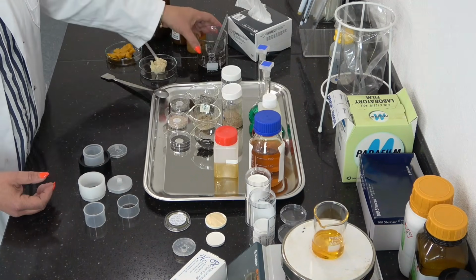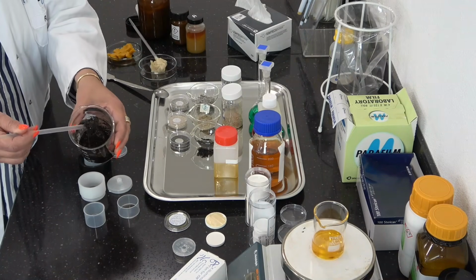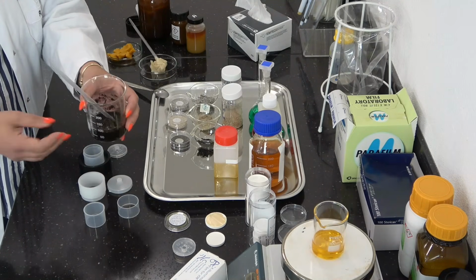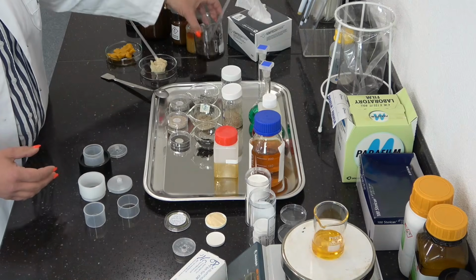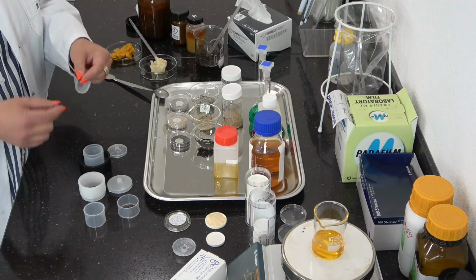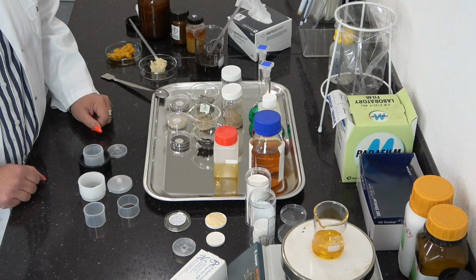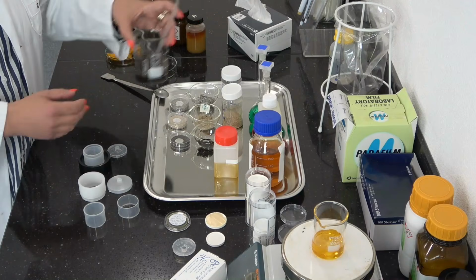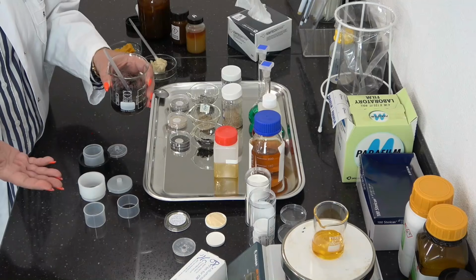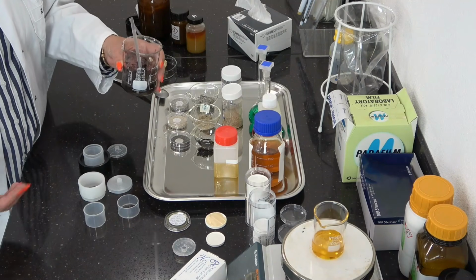For example, if we have samples like these kinds of sludges, slurries, you see you have particles inside. These samples are very inhomogeneous. They can also have very complex matrices, different matrices. There can be particles inside, smaller particles, bigger particles. So how to handle these kinds of samples? Of course, these samples can also be filled into a liquid cup. So this is the easiest way. If you just want to have a quick overview of the sample composition, you can just put it into the liquid cup and start a measurement.